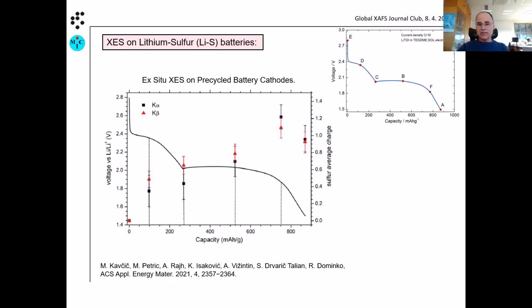But they are very skillful, so they have different electrolytes, and to be honest, this needs to be mentioned. For this particular type of battery, the electrolyte is sulfur-free. That means, because the electrolyte goes everywhere, you don't have any interference with the sulfur signal from the electrolyte; it's just from the cathode.